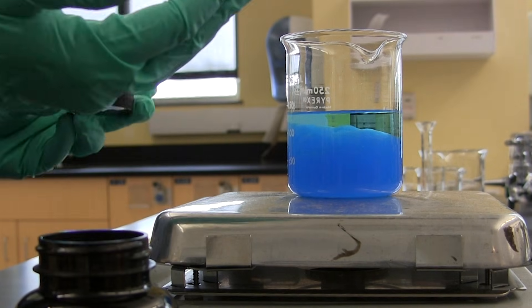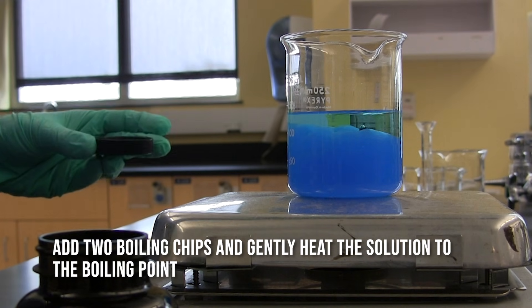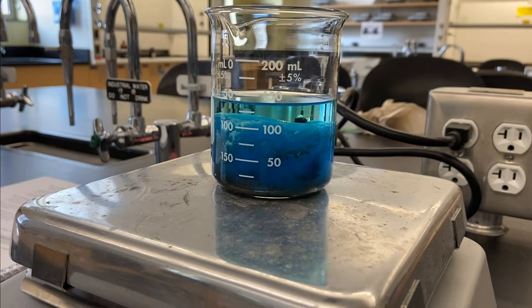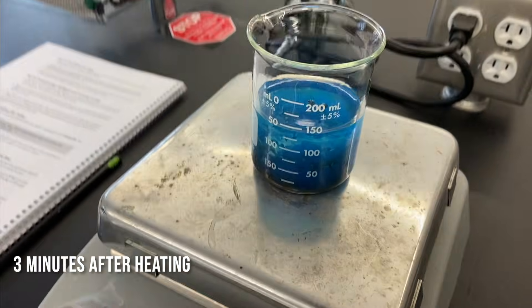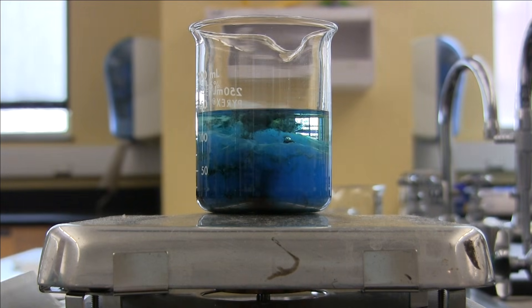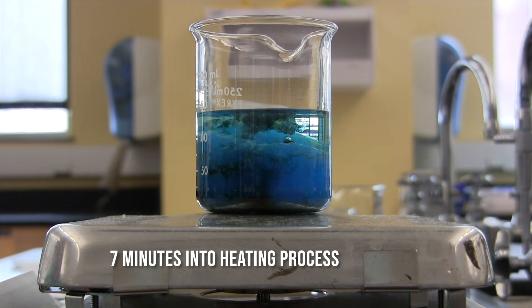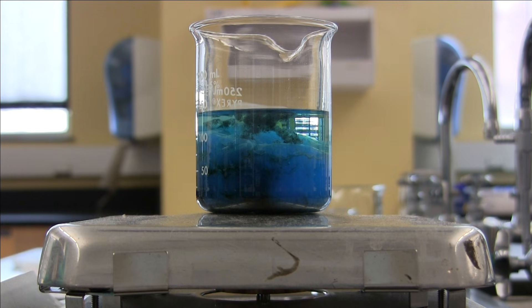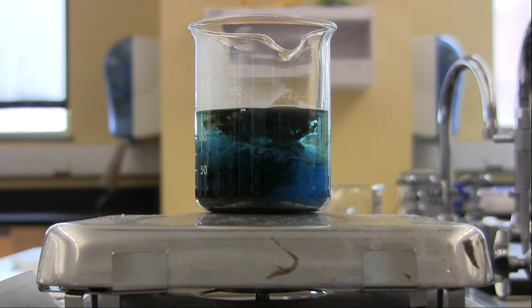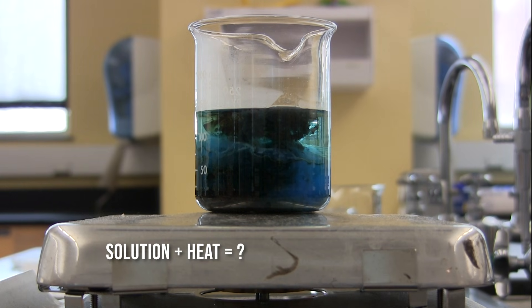Next, I'm going to add a few boiling chips into the reaction beaker and we're just going to heat and see what happens. At this point, it's probably a good idea to be thinking about what could possibly be happening in this reaction, and maybe trying to come to some conclusions or at least some hypotheses about what you think is happening at this stage.